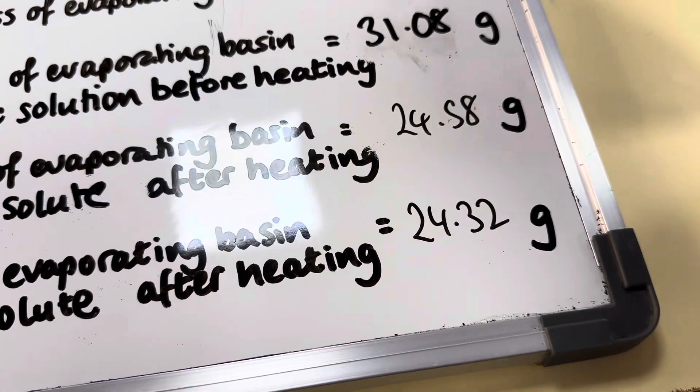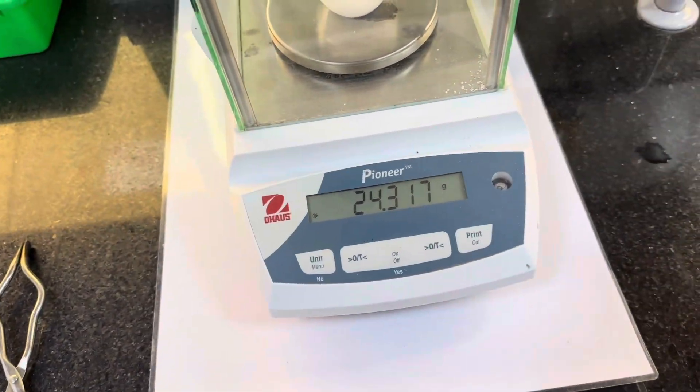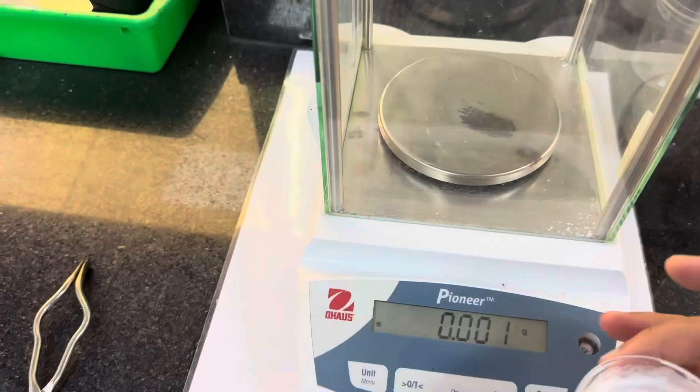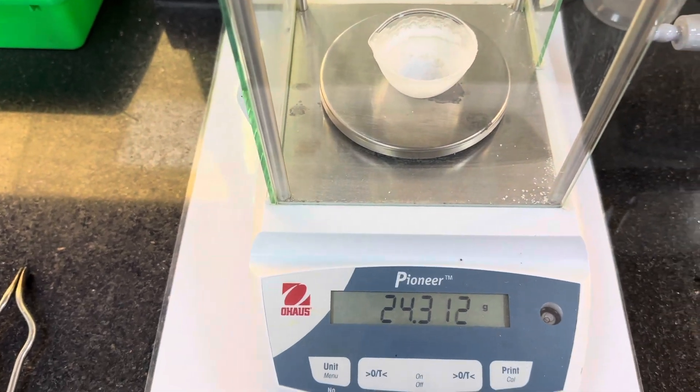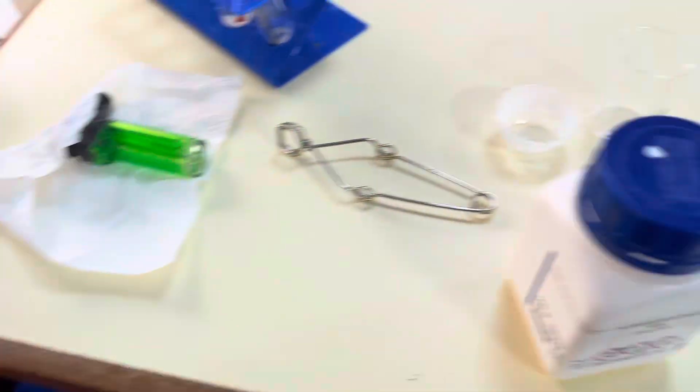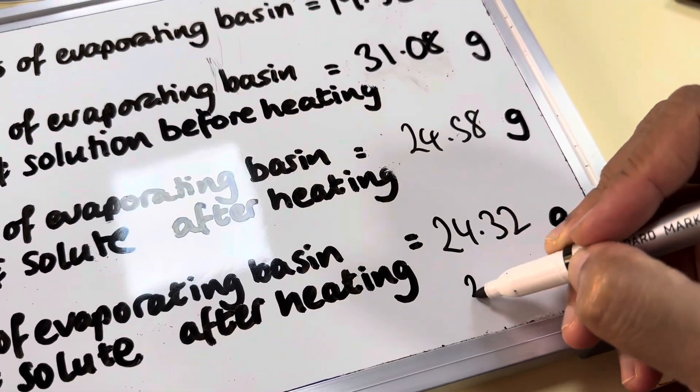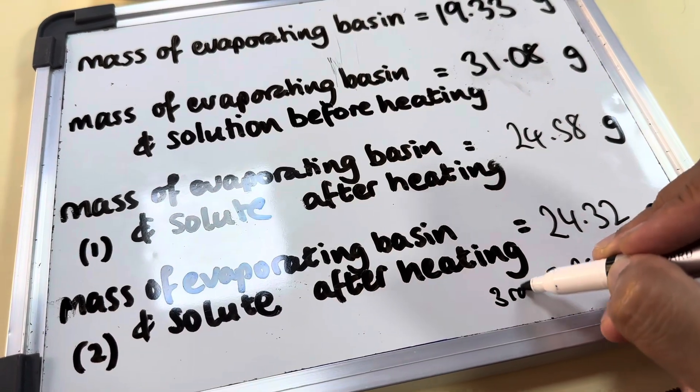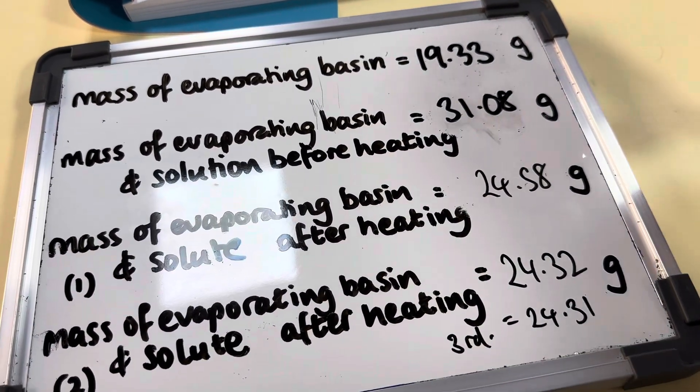Back to the water bath we go. I'm going to measure the mass. If it's insignificant, we will stop. 24.312 and our previous one was 24.32. So it's pretty much where I can suggest it is constant. So it's 24.31. That's the third time. So that's the mass of the evaporating basin and the solute after heating. This is pretty much constant given the accuracy of our balance.